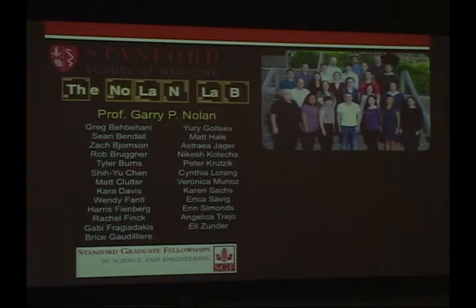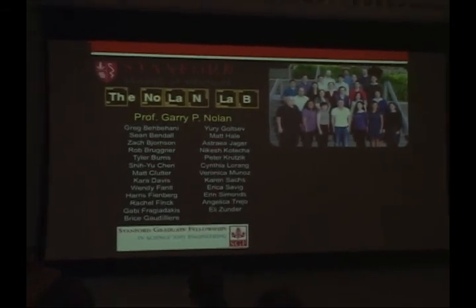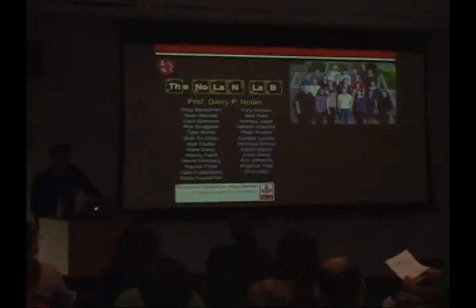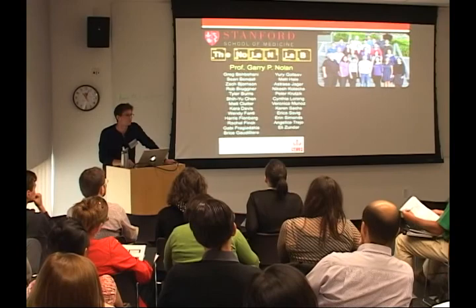Once you make your reagents, are they stable for a long time at 4 degrees, or do you store them in some other fashion, or do you know how long they're stable? Yeah, so I would say every antibody I've labeled has been stable at 4 degrees for at least a year. I've had some that have been sitting in the fridge for like 3 years or longer that are still perfectly fine, and I've had some that after a year start to lose a little bit of their signal, but never had a problem a year or shorter at 4.